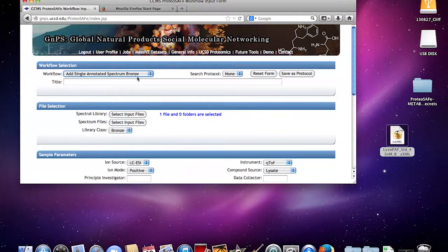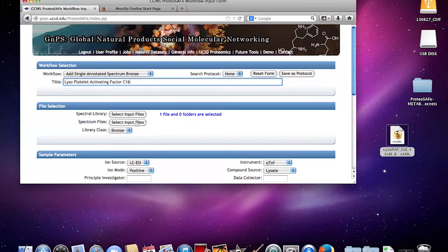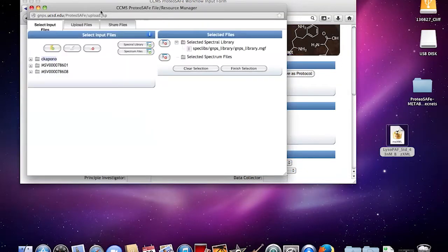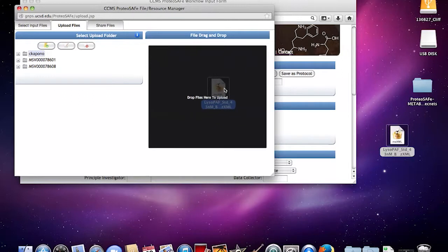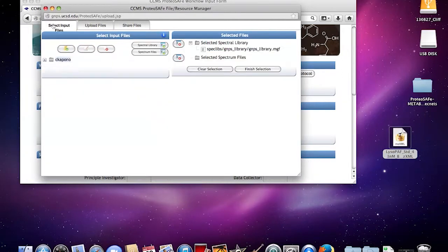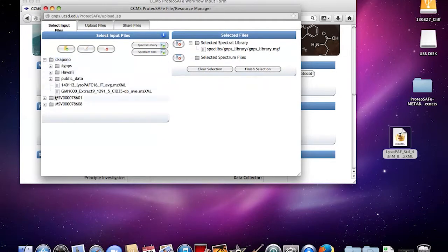I'm going to call this Lysoplatelet Activating Factor C16. Now what we're going to do is upload this spectrum. You can upload files from wherever you want and drag this in here, and it should upload. Then you'll see it in your input files here.